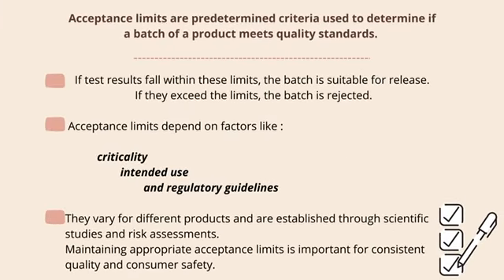Acceptance limits are predetermined criteria used to determine if a batch of a product meets quality standards. If test results fall within these limits, the batch is suitable for release. If they exceed the limits, the batch is rejected. Acceptance limits depend on factors like criticality, intended use, and regulatory guidelines. They vary for different products and are established through scientific study and risk assessment. Maintaining appropriate acceptance limits is important for consistent quality and consumer safety.